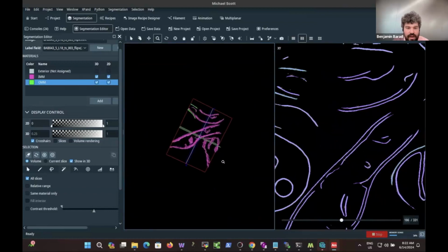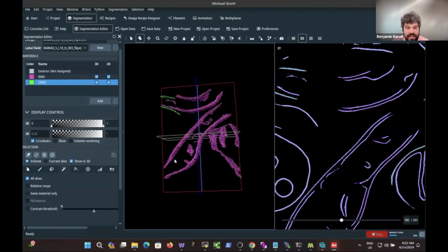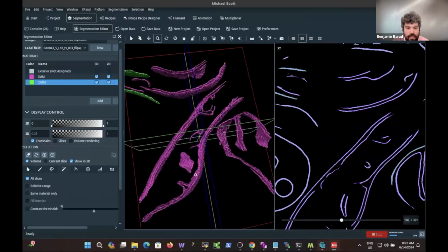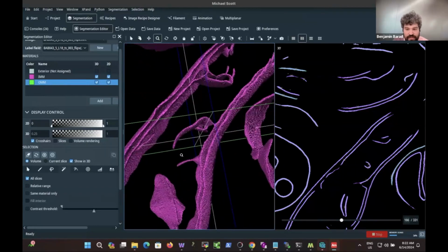Well, I think I underestimated how quick I would be at this. It's very funny because it's been long enough since it's been me doing it that I'm now finding I'm quite slow. But I will show you what we've done so far, and we've grabbed the 3D mitochondria. We have a problem, and this happens sometimes with membrane segmentation data, which is that there's crossovers, so the two sides get linked.